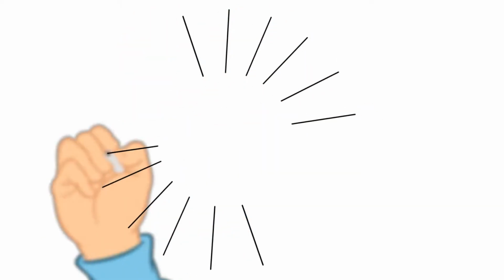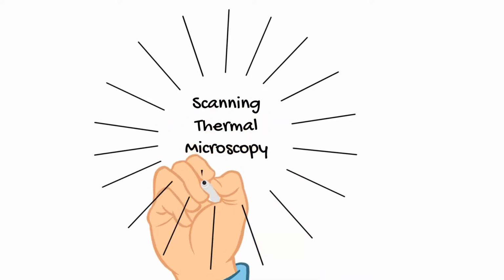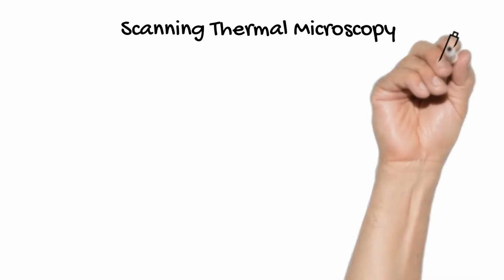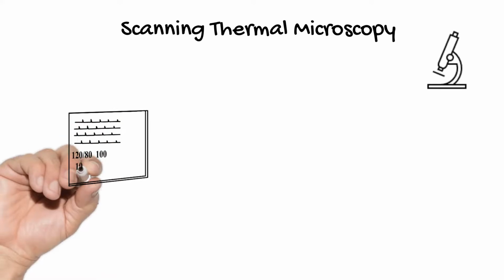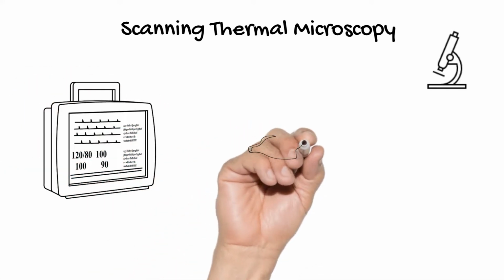Hi everyone, in this video I will talk about scanning thermal microscopy, in short SThM. Scanning thermal microscopy is a technique to obtain thermal information by monitoring and controlling the thermal exchange processes between the probe and the sample.